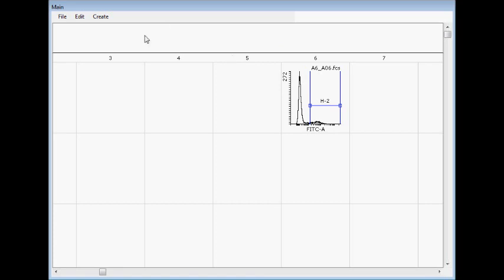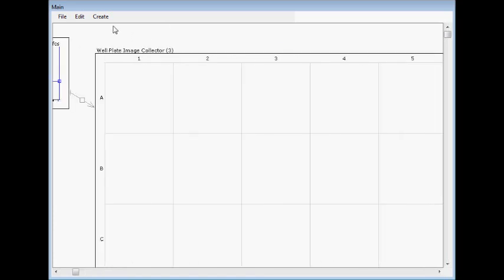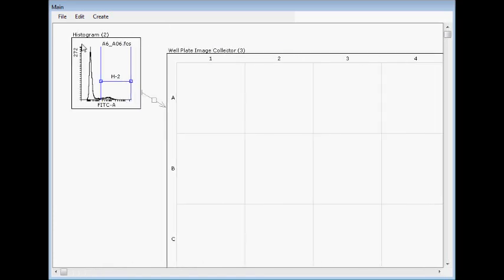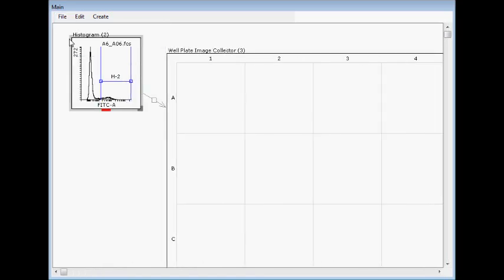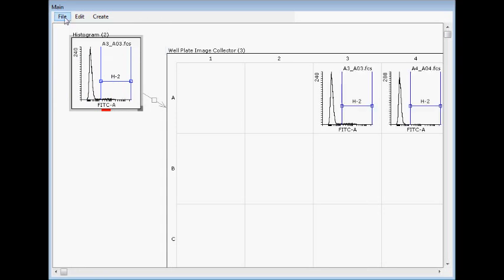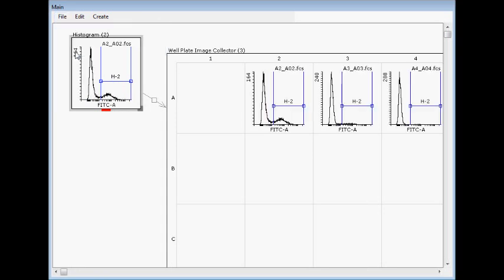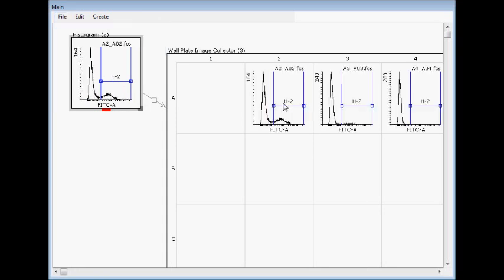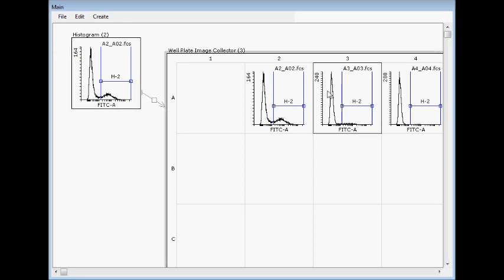Let's have a look, A6, like that. If I jump backwards, we can then see the image like this. Here the same.